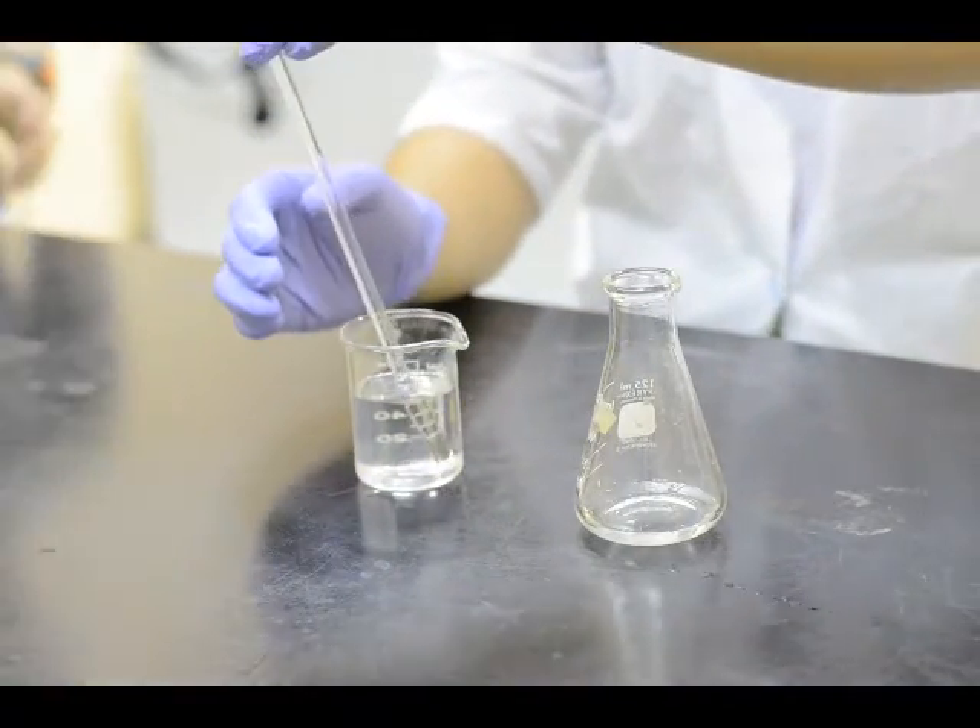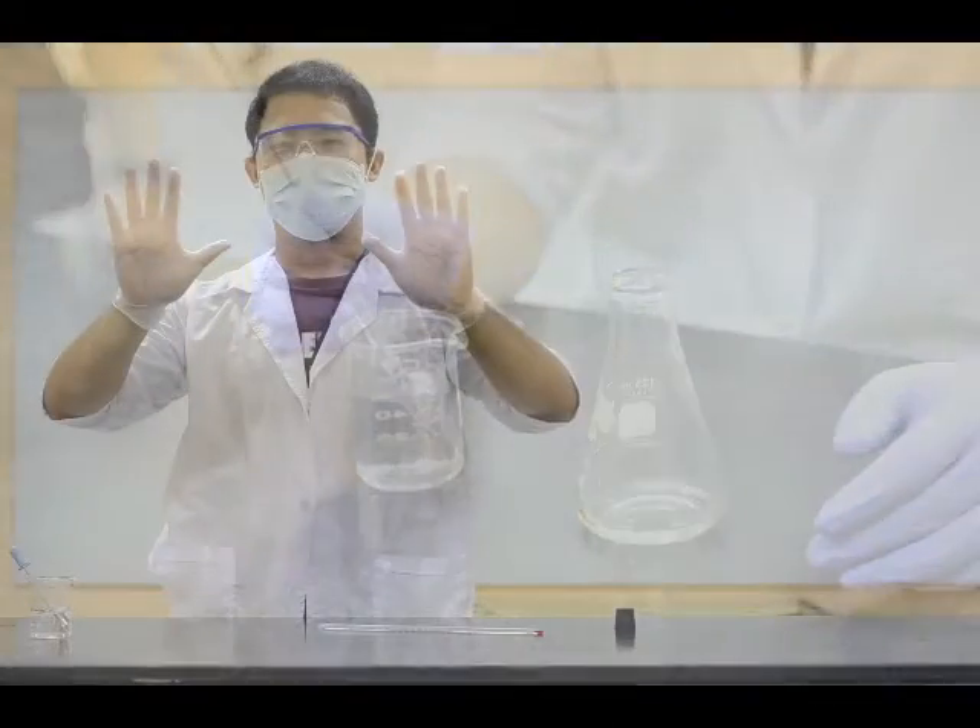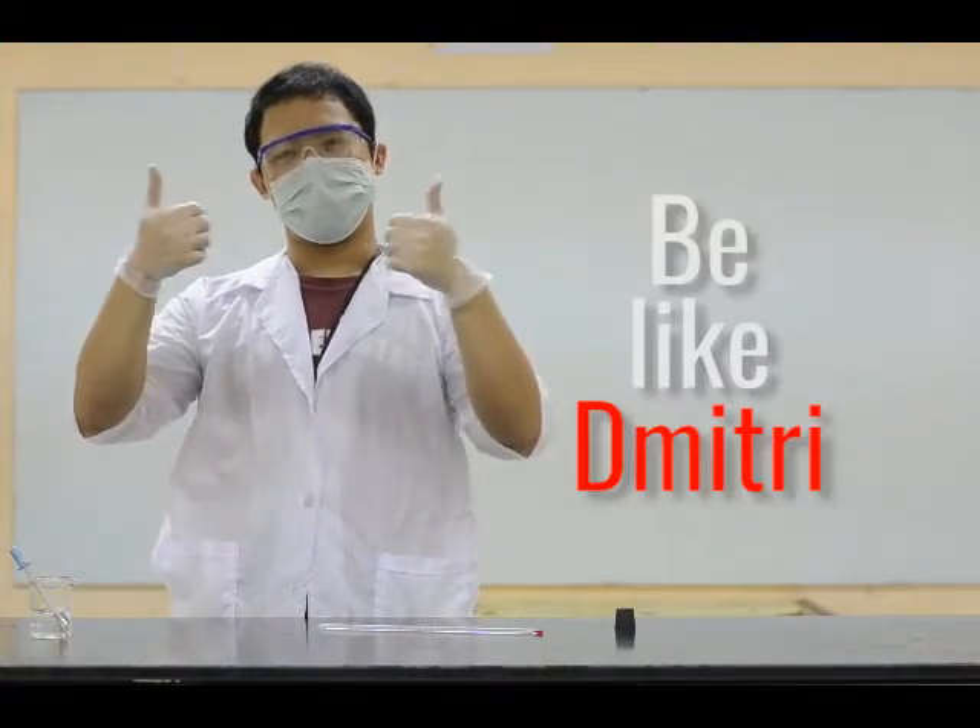Dmitri doesn't want to break a glass rod. Dmitri is smart. Be like Dmitri.